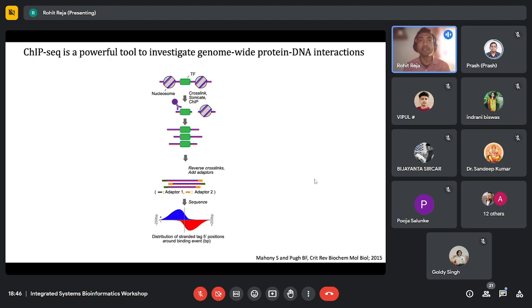If you only use one replicate for each condition, you would not be able to do any of the differential peak analysis downstream. So it's good to have at least two replicates per condition so that you can at least assess how well your system has worked, how well the ChIP-seq protocol has worked, and if you can do some of these further downstream analyses.